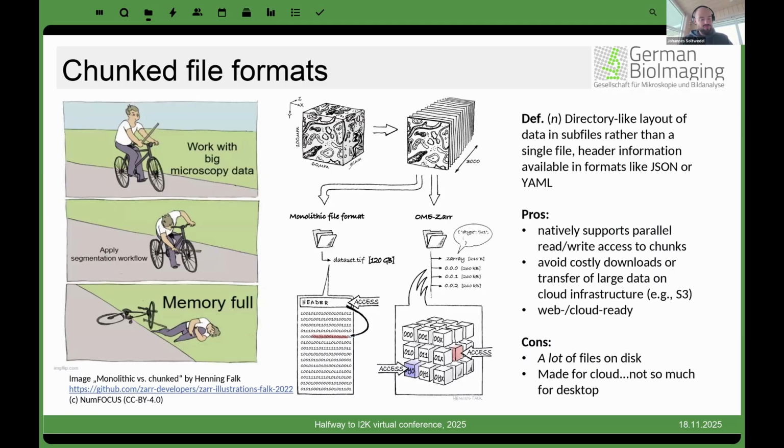And I think when we talk a bit more about the actual file format, about ome-zarr, there's two important conceptual aspects that I would like you to take away. On the one hand, ome-zarr is a chunked data format. And maybe the meme here on the left illustrates it a bit. If we work with big microscopy data, you just apply a segmentation workflow, dumps, memory is full. Like if you do GPU stuff, it happens very, very easily.